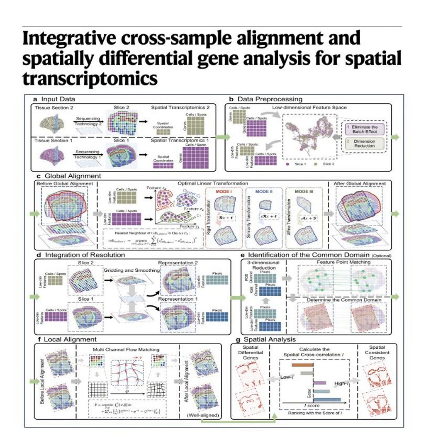And I want to leave you with a forward-looking idea from the discussion section of the source material. Let's hear it. Right now, CODA aligns spatial transcriptomics, meaning it maps RNA expression. But what happens when we integrate this exact same framework with spatial proteomics, mapping the actual structural proteins, or spatial epigenomics, mapping the DNA accessibility? Oh, wow. Layering all those maps on top of each other. Yes, a true multi-omics 3D atlas.